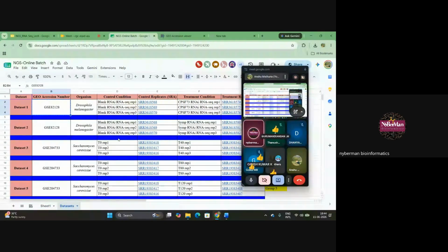Anshu, I have one clarification here. Yes, Pavani. Regarding the reference genome, do they know how to download it? Yeah, I have mentioned that before when I explained the FASTA sequence. So they can directly retrieve it from NCBI and save it in the FASTA format. Can you please demonstrate it once now? I'm asking about the reference, not the GSC sample.